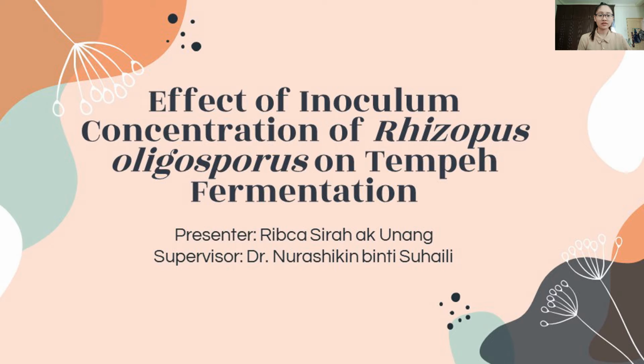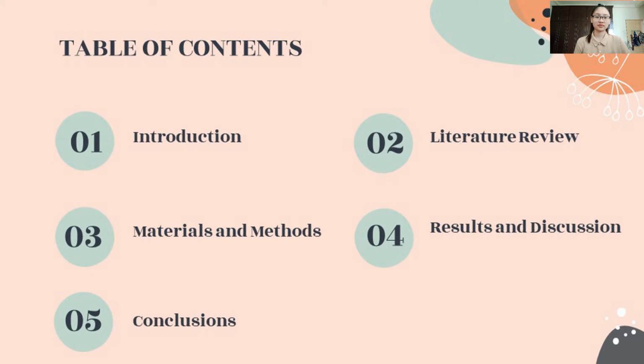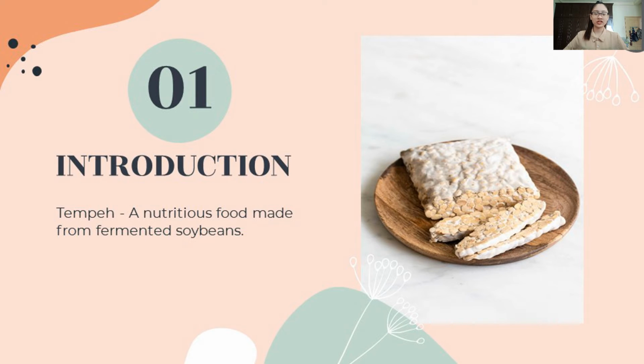My supervisor for my final year project 2 is Dr. Nurashikin binti Suhaili, and I will be presenting about the effect of inoculum concentration of Rhizopus oligosporus on tempeh fermentation. The content that I will be presenting will be divided into introduction, literature review, materials and methods, results and discussion, and finally, conclusion. Tempeh is an Indonesian traditional fermented soy product made of whole beans or legumes, commonly soybeans.